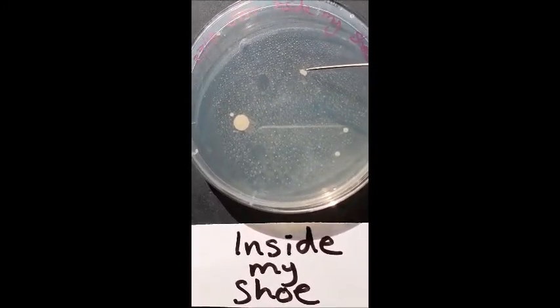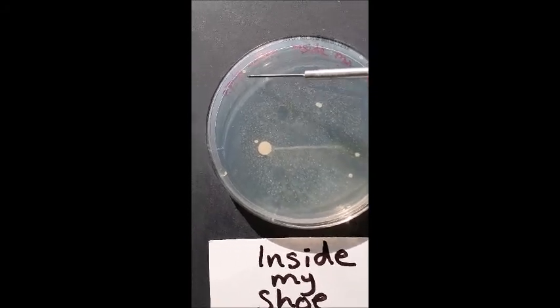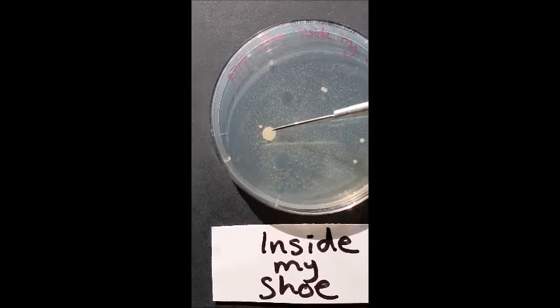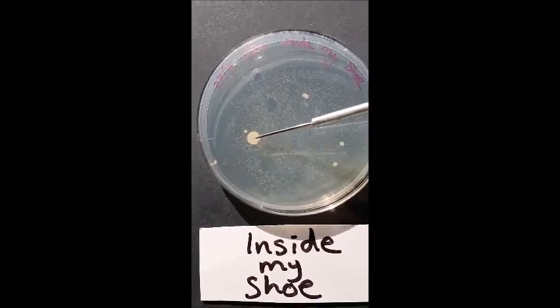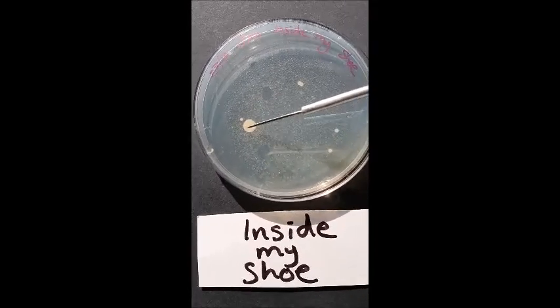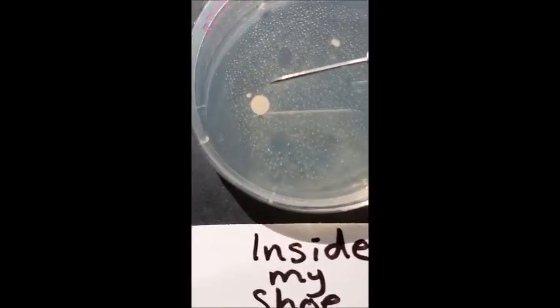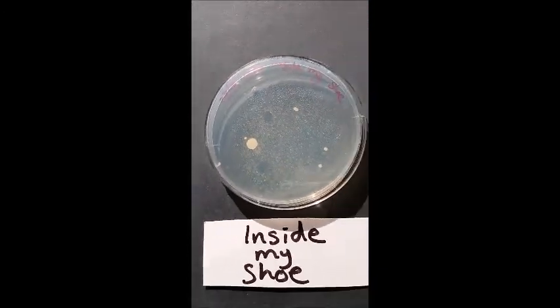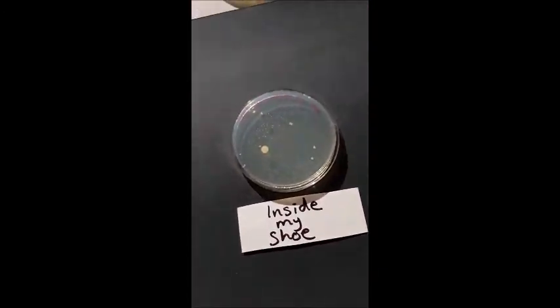See how there are 2 colonies there? That's 3, 4, 5, 6, 7, 8. Now this big guy, I think that is clearly a different kind of bacteria to those because it has grown way bigger in the same amount of time and it is slightly a different color. So that's inside my shoe.